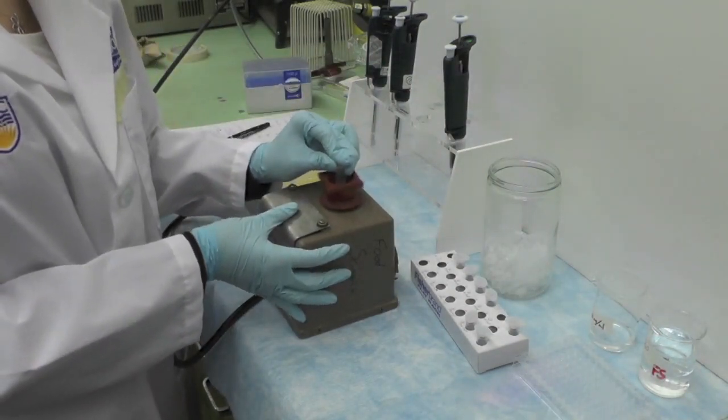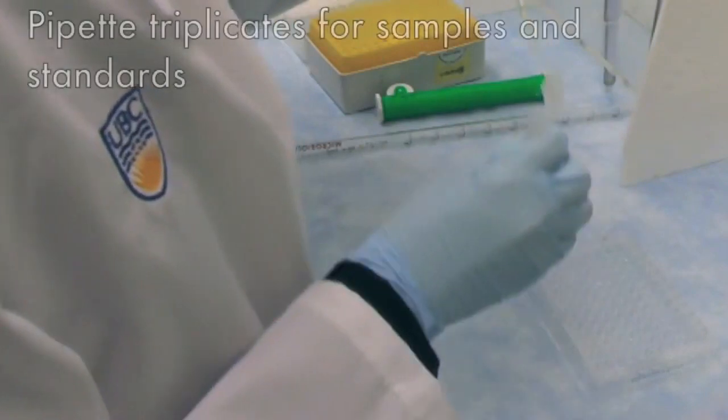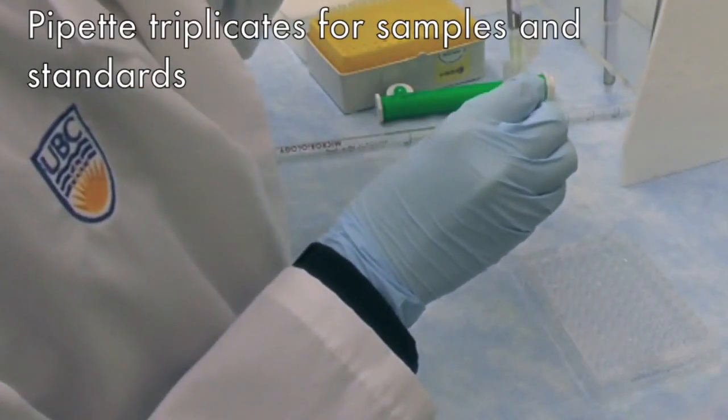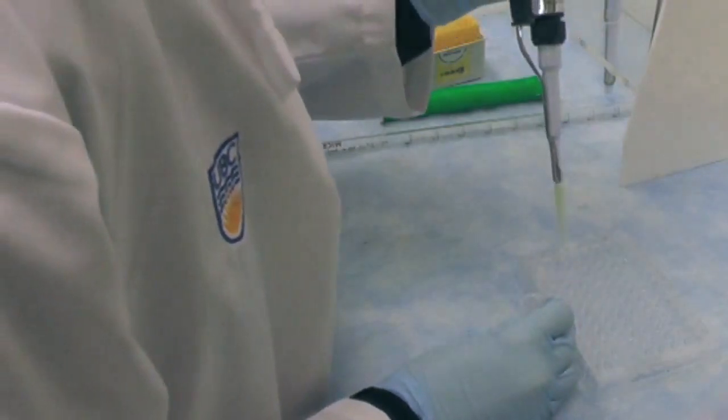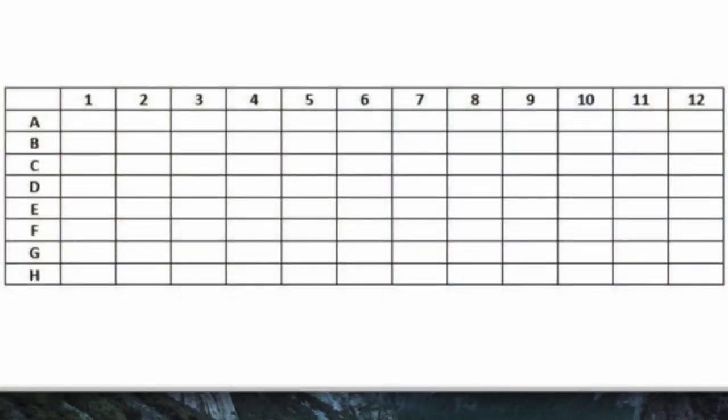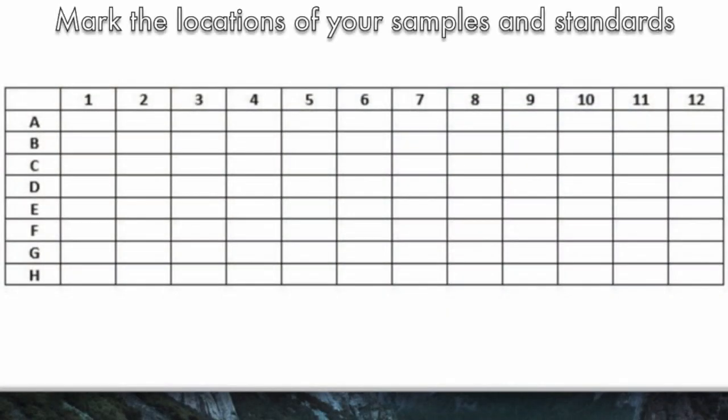Prepare all your standards and samples. Pipette 10 microliters of your standard solution and samples in triplicates into the microplate. Either print the microplate template that is provided on Connect or draw the template on your notebook. Record the location of each standard and sample within the well.